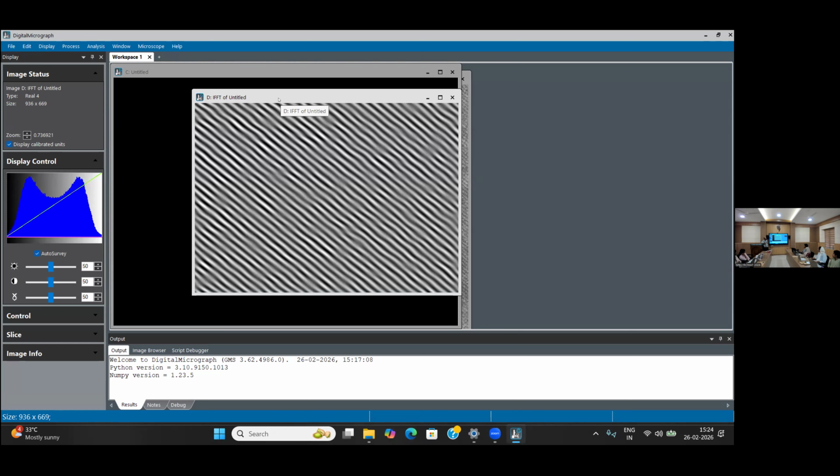Okay, so you just install the free digital micrograph software on your laptop. Just load your lattice fringes image, and if you want to select the region, it doesn't work here, so I don't know why. But you can choose the region somewhere. If it is very clear, you choose that region, and then in process take this FFT, and then on right click you can see the tools. Okay, and then you choose the selection tools, we can select these diagonal spots, and then apply mask. After masking you just keep the masked area only, and then go to the process menu, take the inverse FFT, and you will get the enhanced image of your region.